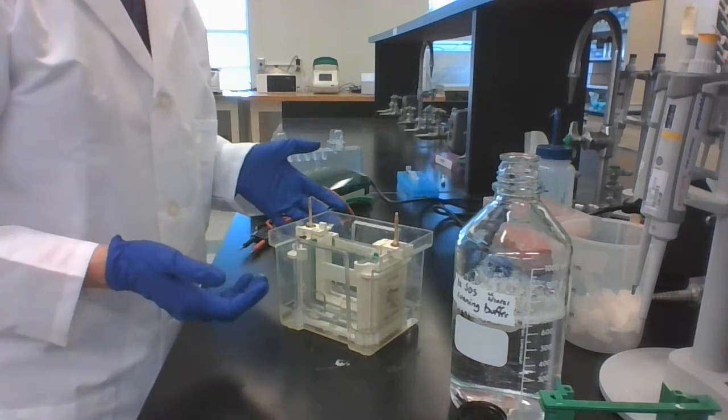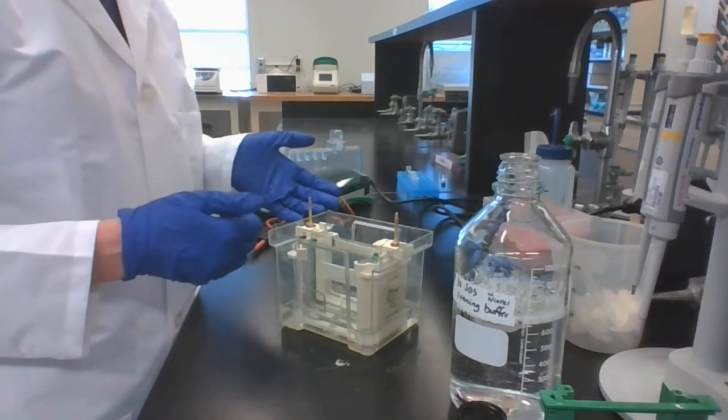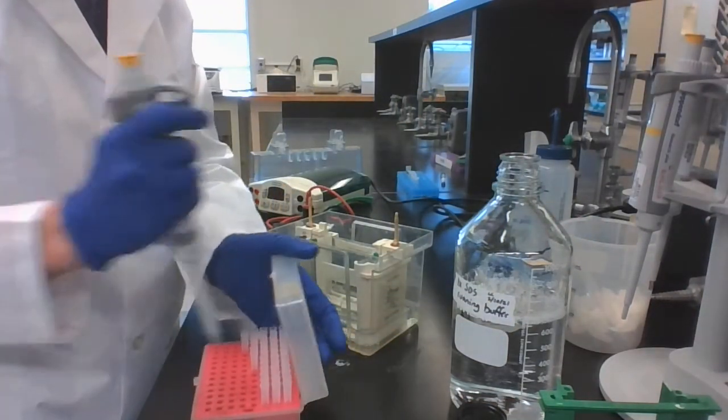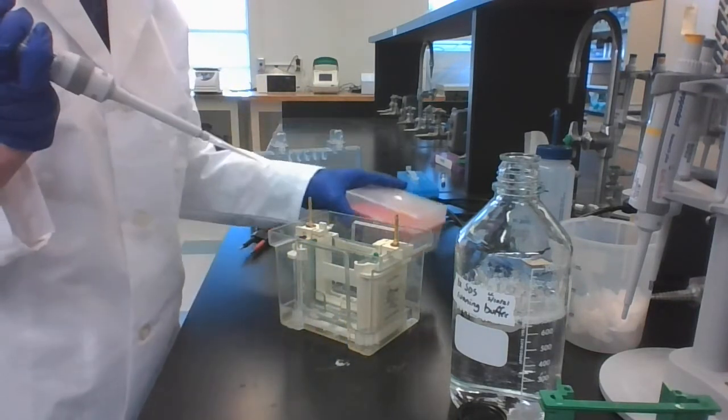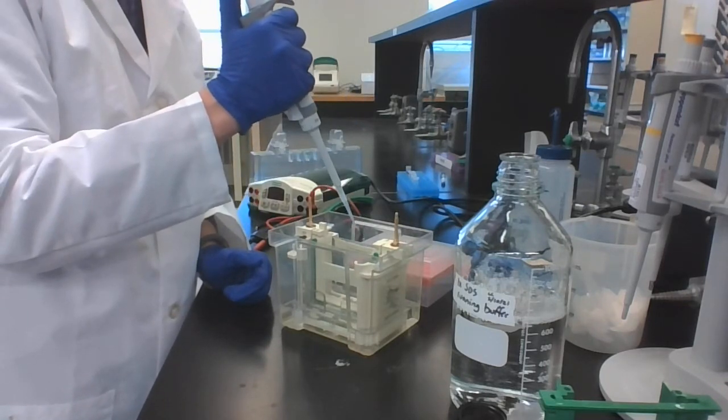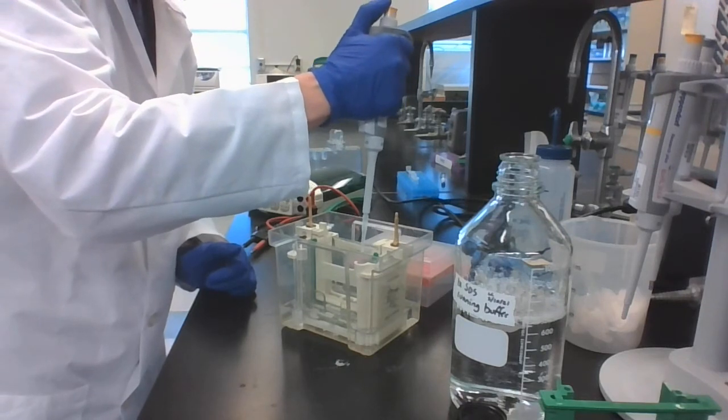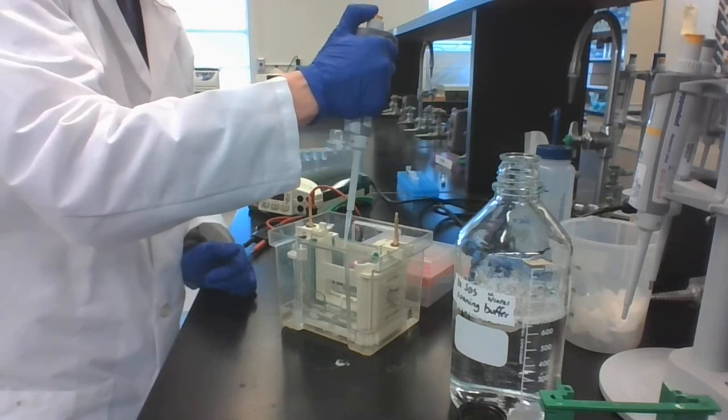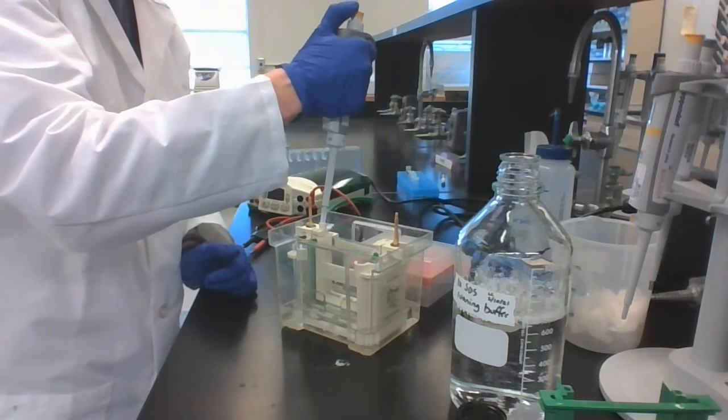Now, one thing that you can do to help your samples run really well is actually wash out the wells with pipetting. This helps you get rid of any unpolymerized stuff that might be hanging out in the wells. I'm going to get about 100 microliters. I'm going to take some from the middle of where the buffer is, and I'm going to basically just pipette up and down all the way across here. If you want to get really careful with it, you can aim your pipetter into each well. But it's usually okay just to pipette up and down a bunch more times.